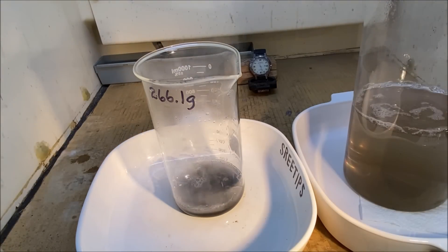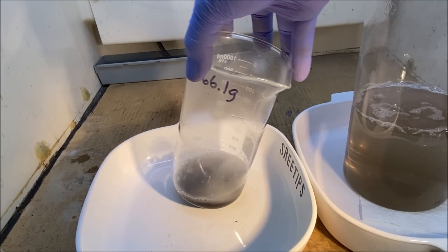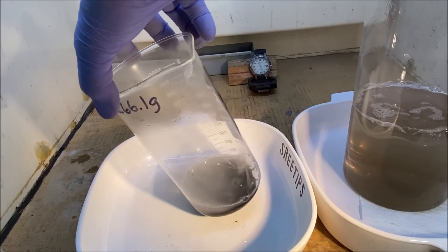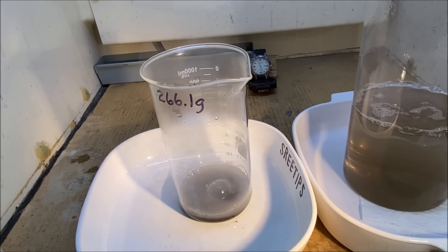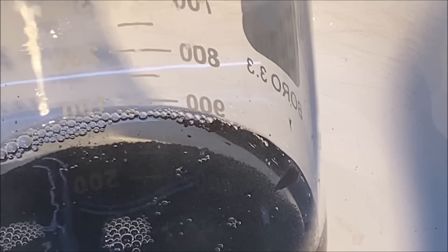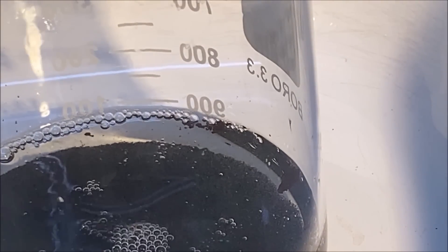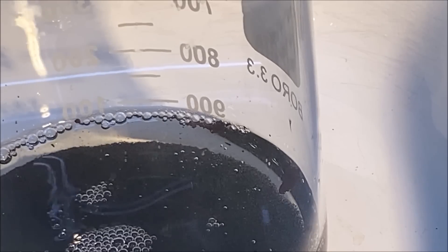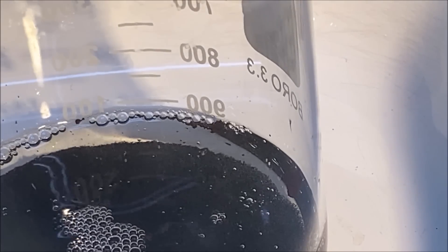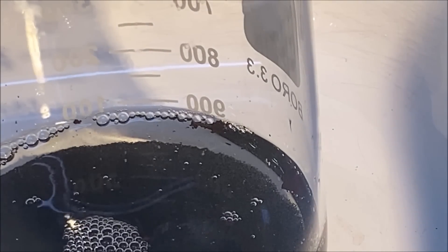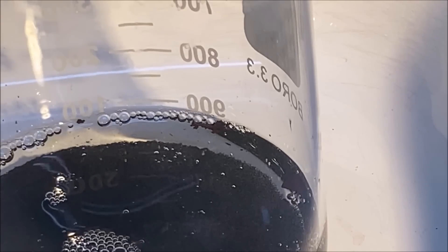And you can see the zinc reacting with that hydrochloric acid. This is how we're going to get all the zinc out of there. Just hit it with some hydrochloric acid until there's no more reaction. And then we can pretty much conclude that all the zinc has been dissolved.